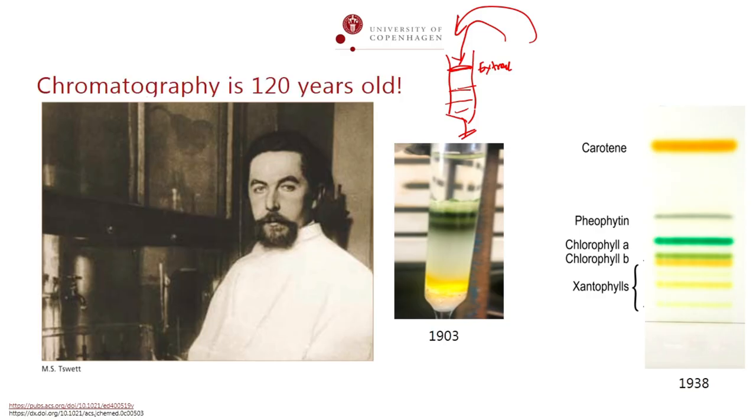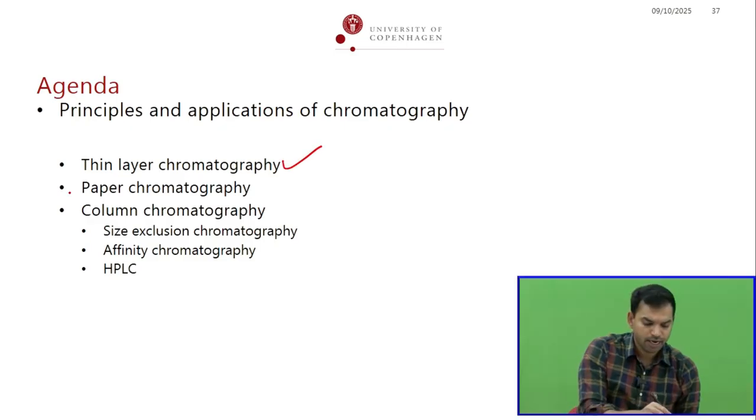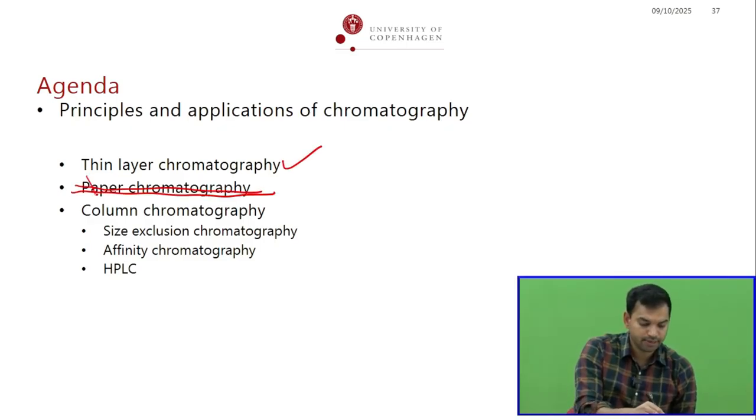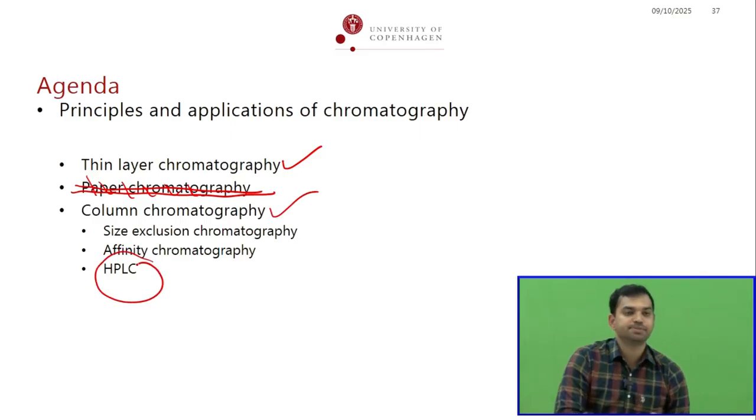So I'm going to teach you a couple of chromatographic techniques, mainly thin layer chromatography. I won't teach you paper chromatography today in the interest of time. A little bit about column chromatography and mainly about HPLC.